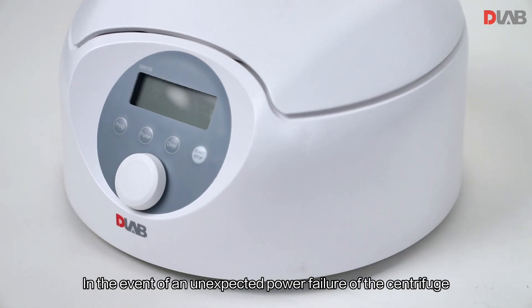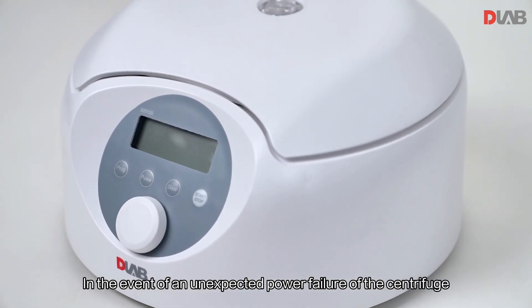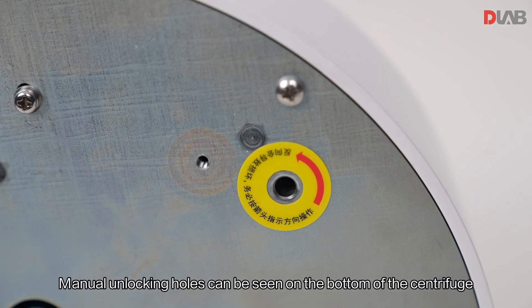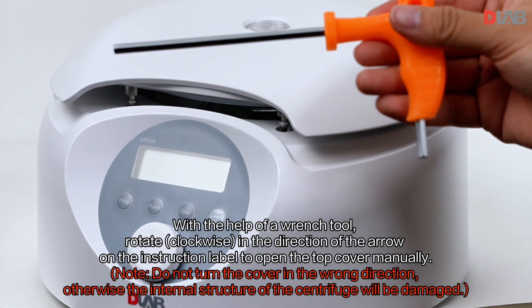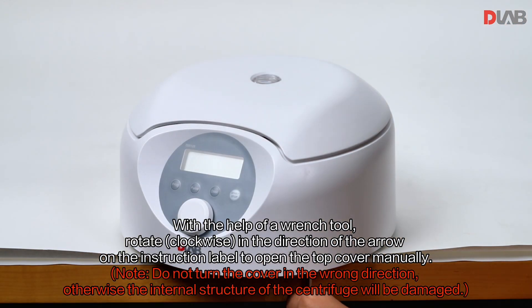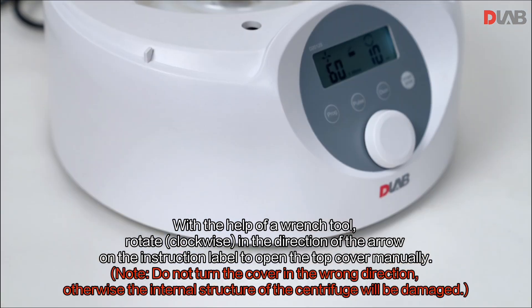In the event of an unexpected power failure of the centrifuge, manual unlocking holes can be seen on the bottom of the centrifuge. With the help of a wrench tool, rotate clockwise in the direction of the arrow on the instruction label to open the top cover manually.